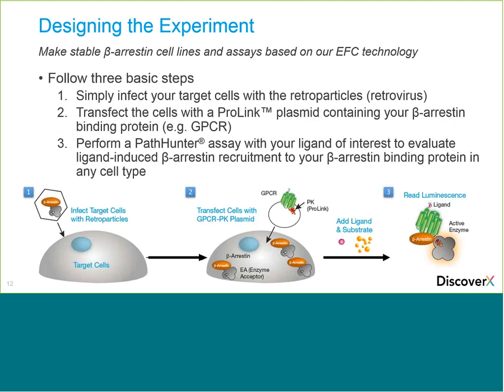And what this does is it corrects or stabilizes the GPCR mutant, allowing it to properly traffic to the membrane. And these chaperones can be used as drugs as well to correct the system. And then once that GPCR properly traffics to the membrane, it can be rescued, so you can perform a functional assay using an agonist. In this case, it's procaterol, and that's on the x-axis.